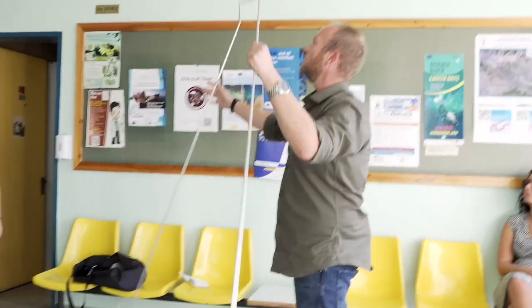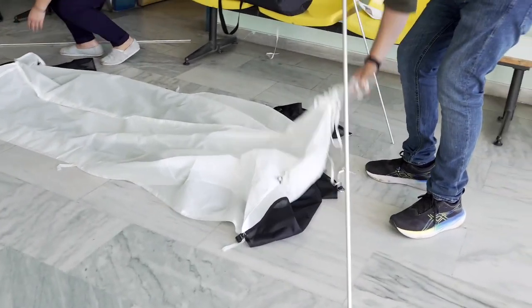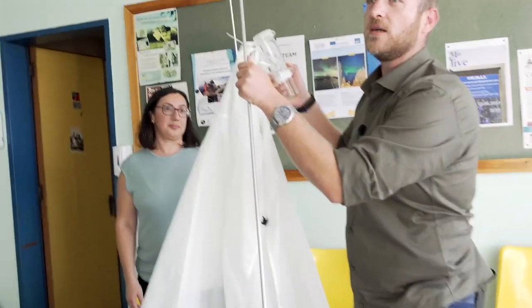And we start from the front side. The front side of the trap is the one who has the bottle. Inside here, we collect the insect.